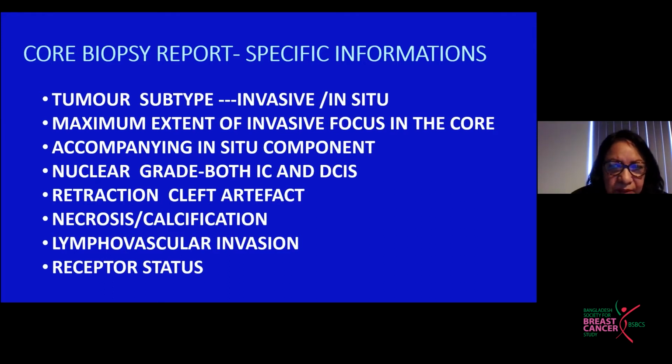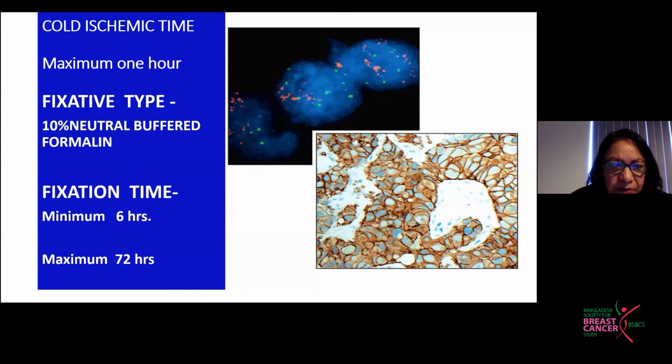Now, some more points about the tissue preservation, which is quite important. This is the cold ischemic time, which is very important. The cold ischemic time is the time period or interval between the removal of the tissue from the body and up to the immersion of the tissue within the fixative before sending it to the laboratory. So it should not exceed more than 1 hour.